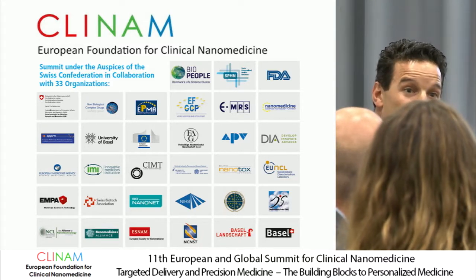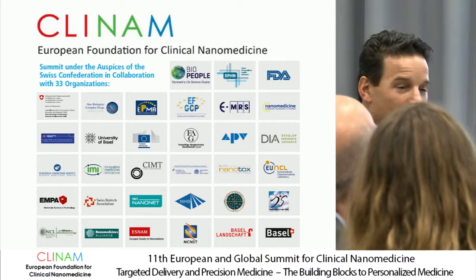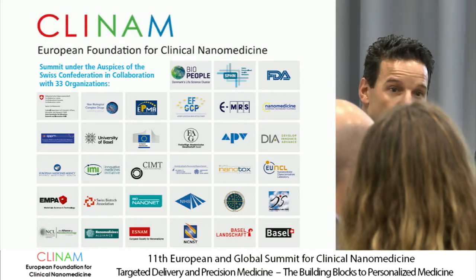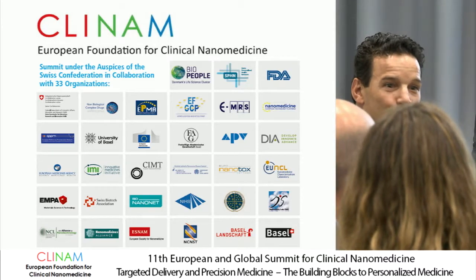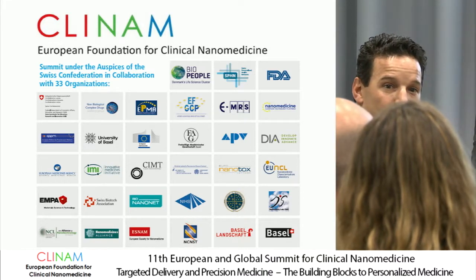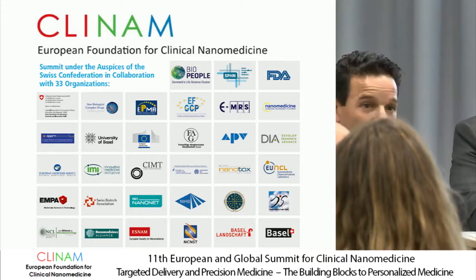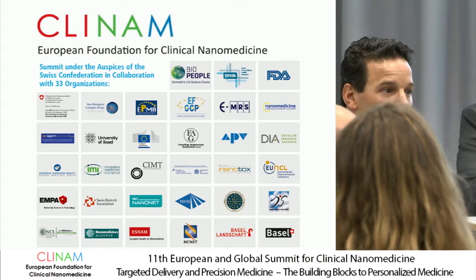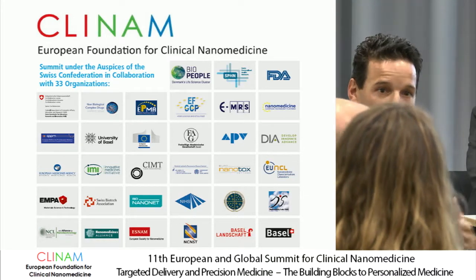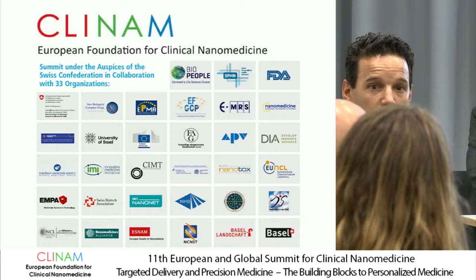But then I go back to the data mining, because the most complicated system produces a large amount of data. So for one measurement, it takes a week of data analysis. And if you have a wrong measurement with wrong settings, you're wasting a lot of time and you don't get the answer that you want. I hope I throw more back into the pool for discussion, because it's very important that we come with an opinion, or at least a set of questions that we can reiterate back and address to the different people in the room, and then expand out to the rest of the community.